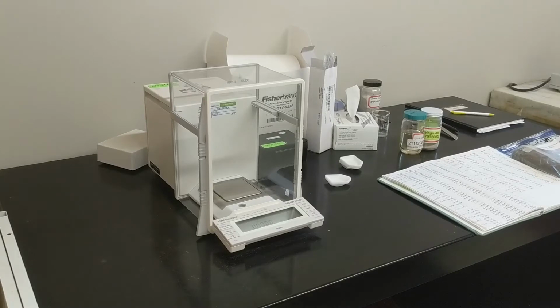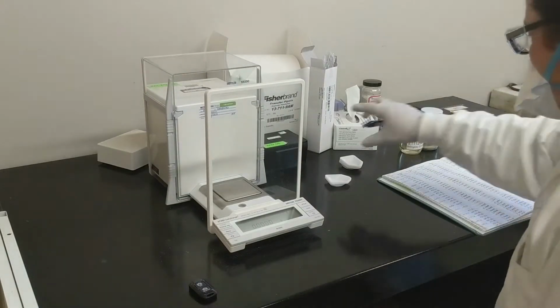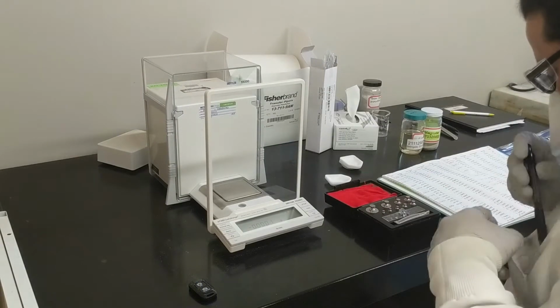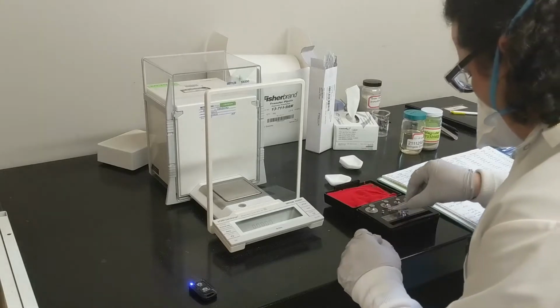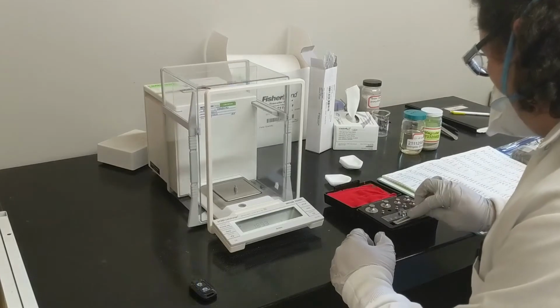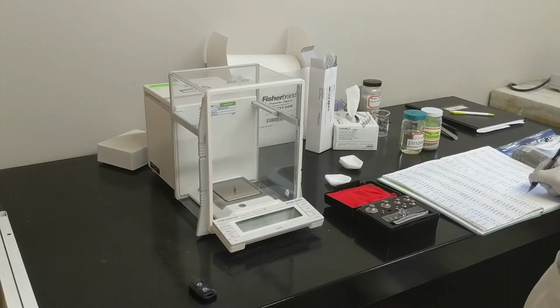Hi, this is Darren Nakamura with the Mississippi State Chemical Laboratory, and today we're going to be doing some microwave digest training. Now, this is sort of the first step in a lot of our inorganics analyses. We do it for our atomic absorption samples, we do it for our ICP OES samples, we do it for our ICP MS samples, that might be it, but that is a lot of our samples.